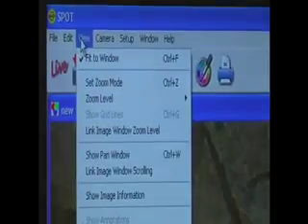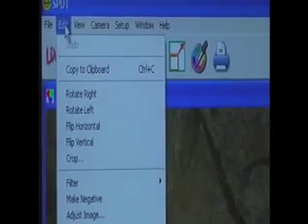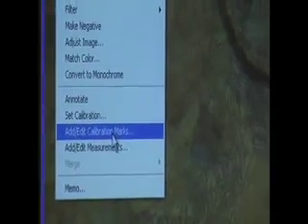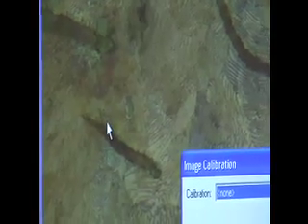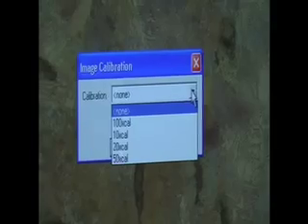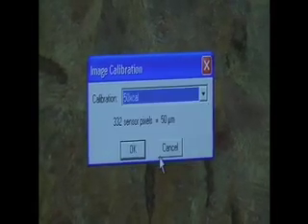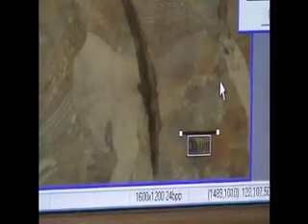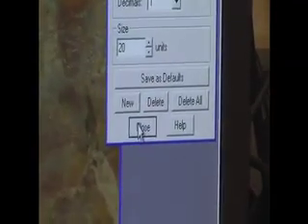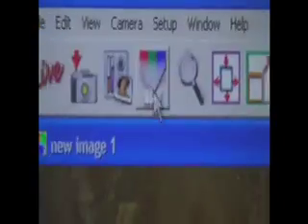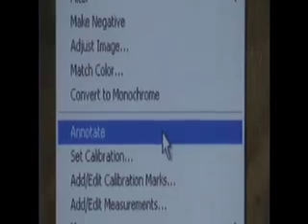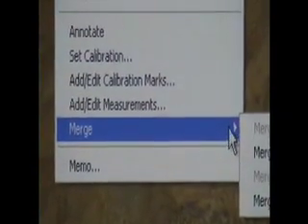To add calibration marks to your image, go to Edit, then Add Edit Calibration Marks. Select the lens magnification you used to take the image. Select the proper unit length for the selected magnification. Then click the New button and click on the image to place the calibration mark. Once you are done adding calibration marks, go to Edit, then Merge Calibration Marks. Now save your photo.